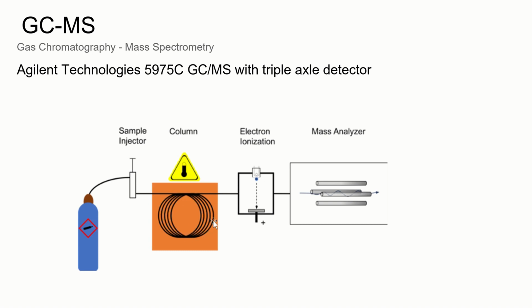Once it condenses in the column, it will then react with the stationary phase, and as the ramp rate of the oven goes up and increases the temperature, they will elute and separate by boiling point and how much they react with the stationary phase. Once it elutes out of the 30-meter long column, it will go through our detector, which will perform electron ionization on whatever elutes, which bombards it with electrons. This bombarding of electrons is repeatable and can be redone multiple times over and over.